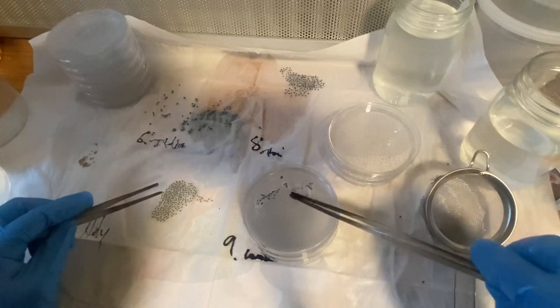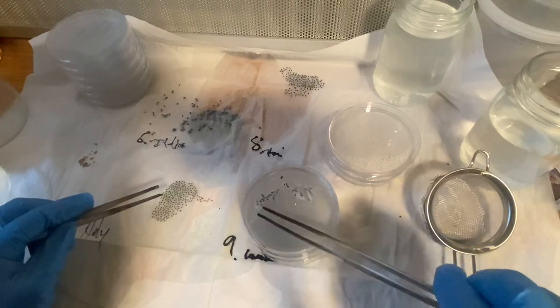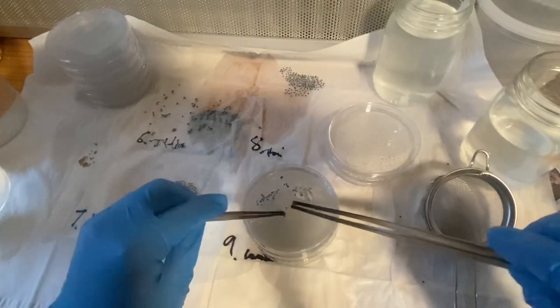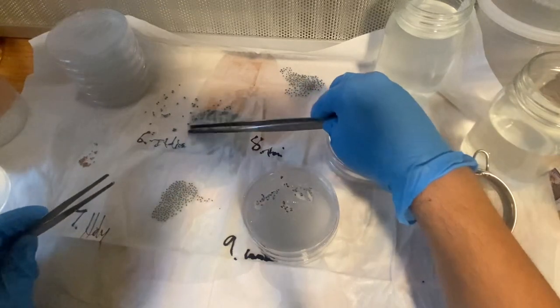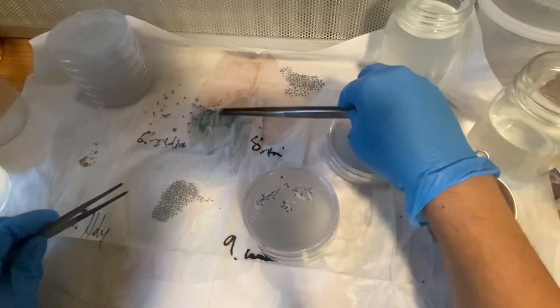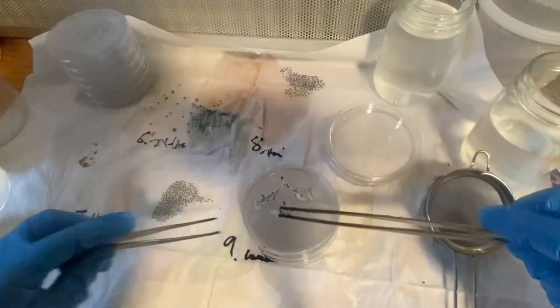There's a plastic coating in between it to help that there's no contact with the table, even when it rips like this. So there's another coating still there. And that just helps with certain seed types. Don't want to add it if we don't have to. But this is going to be the plate that has it.